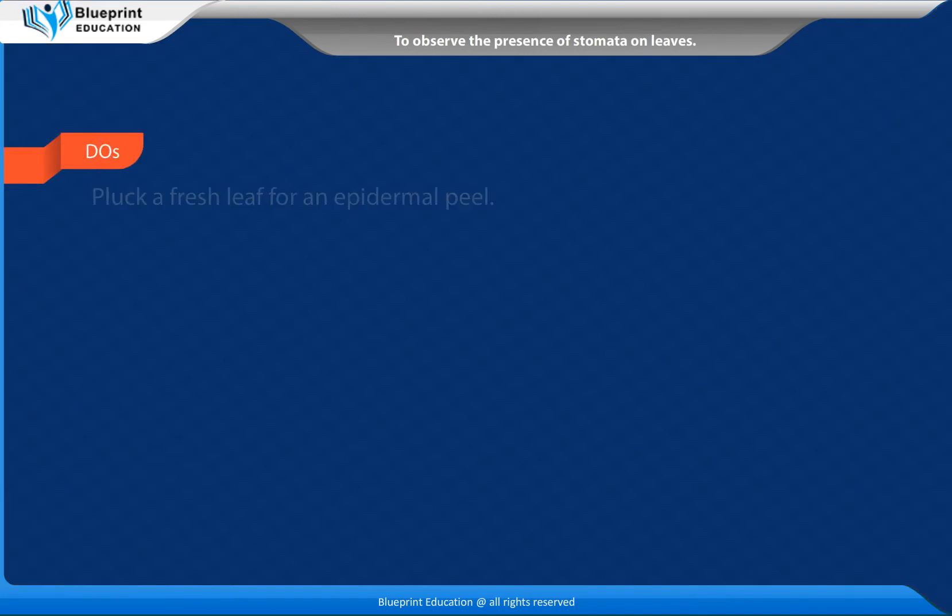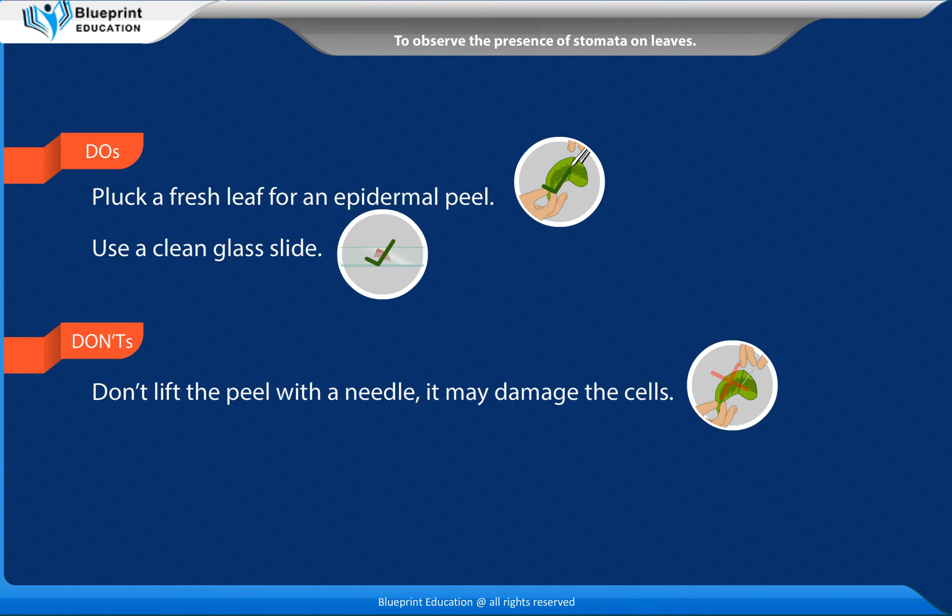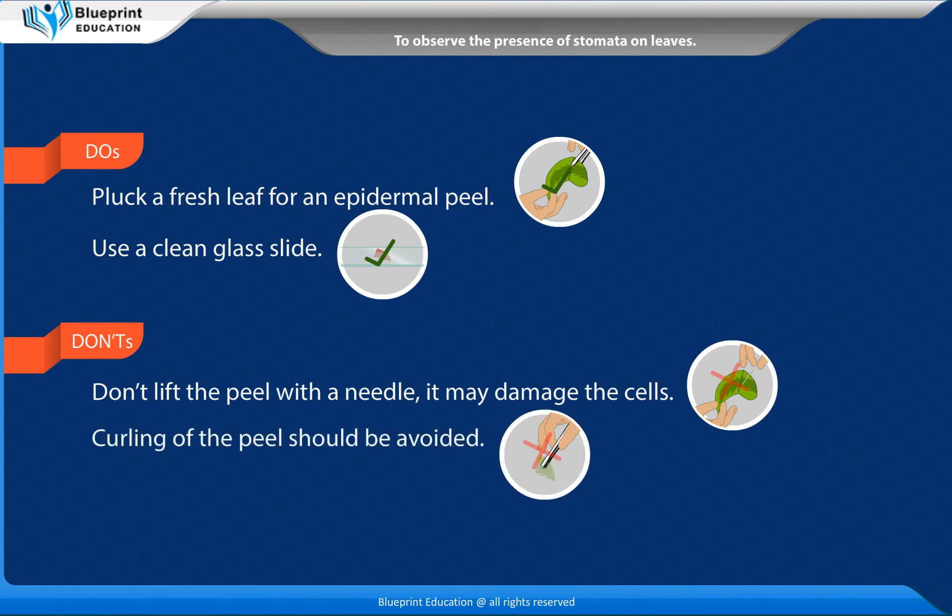Do's: Pluck a fresh leaf for an epidermal peel. Use a clean glass slide. Don'ts: Don't lift the peel with a needle, as it may damage the cells. Curling of the peel should be avoided.